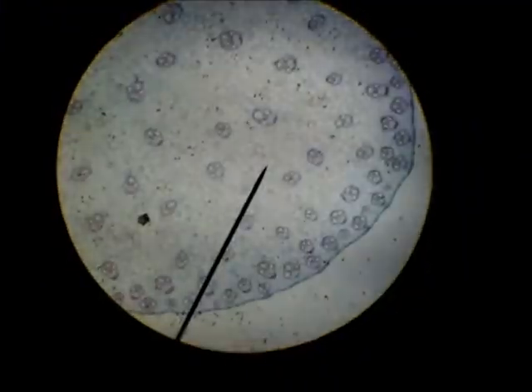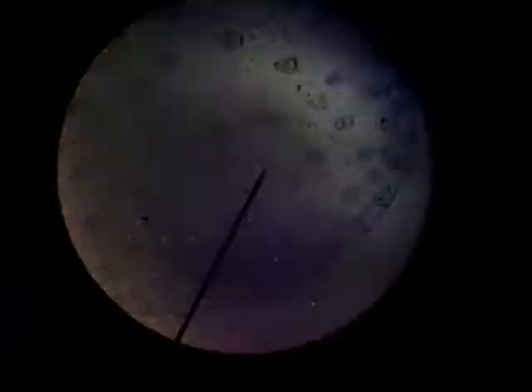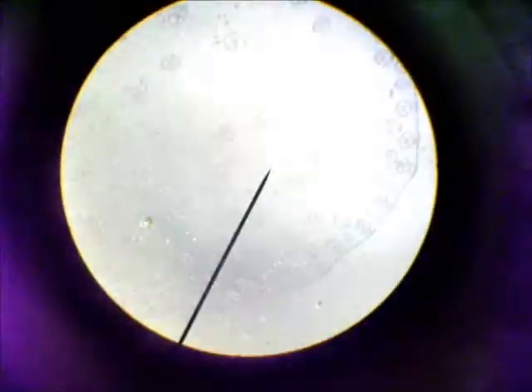This is a cross section of a stem of a monocot. In the monocot, the phloem and xylem are randomly scattered.